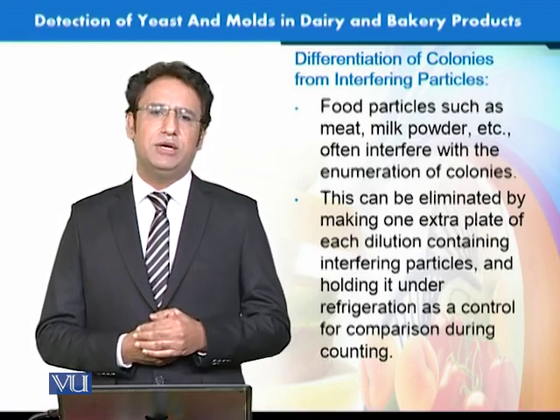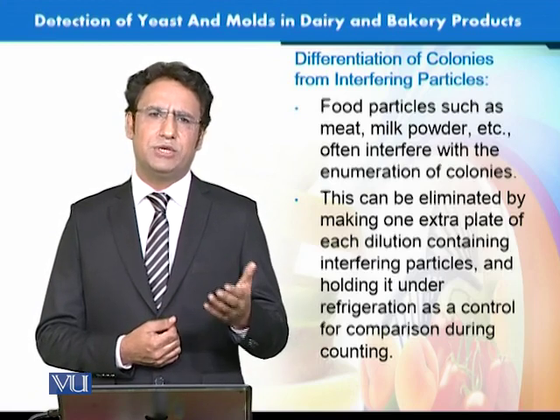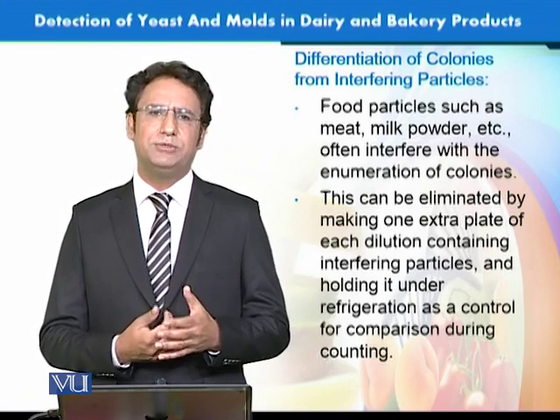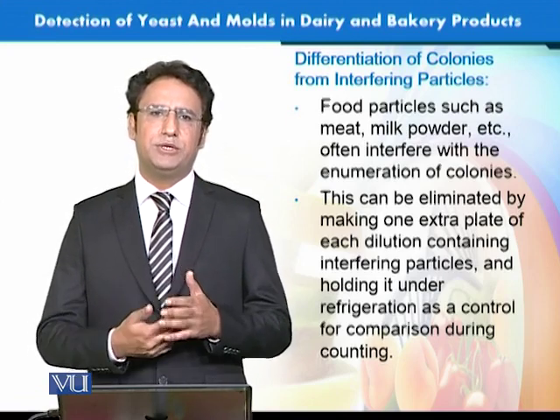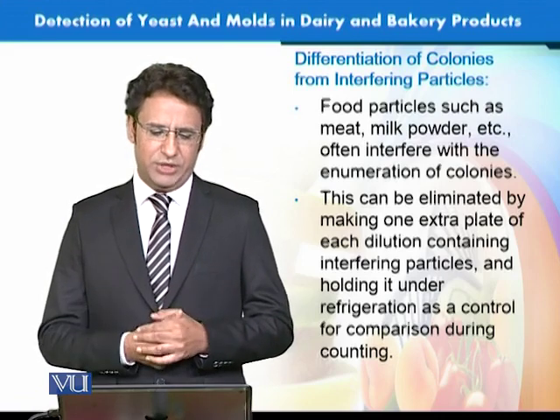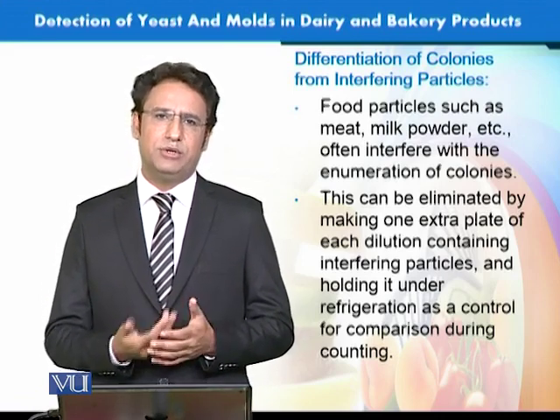We normally refrigerate the samples for some time, and that helps to identify colonies versus the food particles. So this was the method for detection of yeast and mold in dairy products or bakery products.